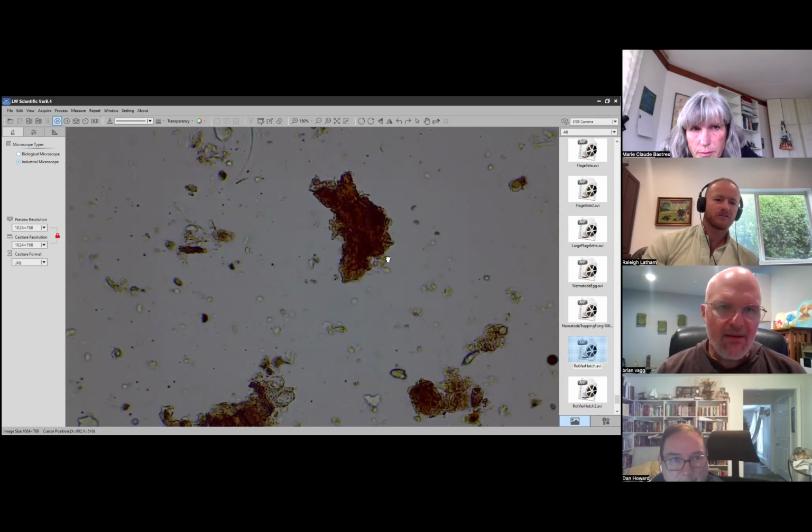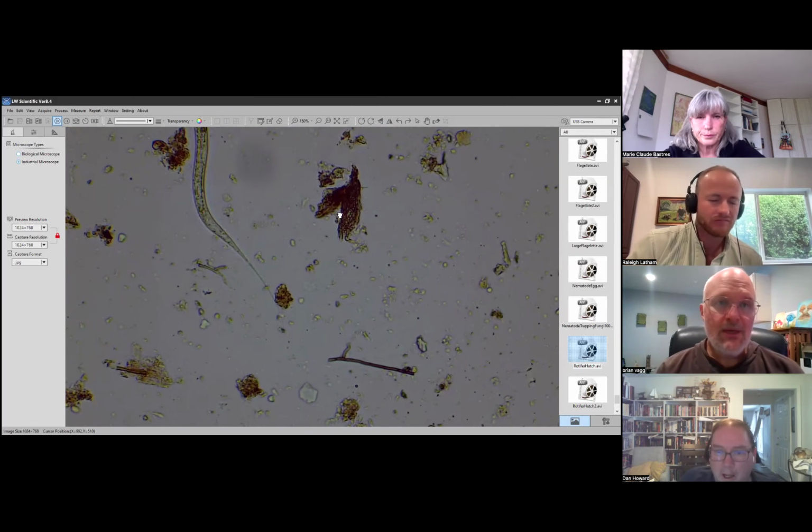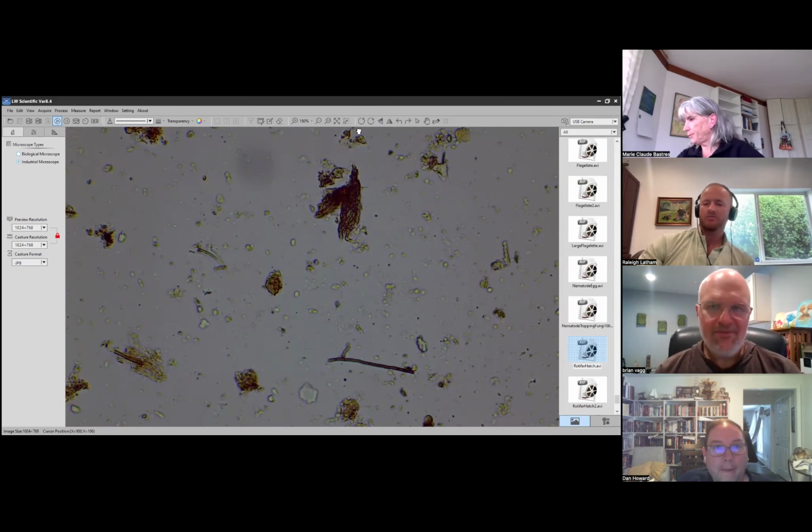What a great sample. Thanks, Dan. That was great, awesome. Beautiful. Should we take a look at Marie's? Yeah, let's check out Marie's and then we can hop on to some other things.